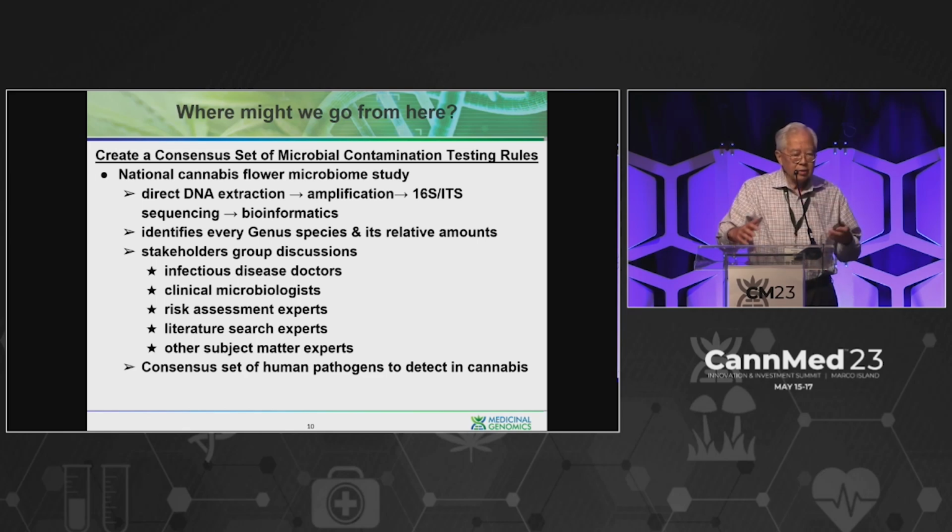So one has all this DNA now that you've amplified, and then you do sequencing of this DNA. There's now nanopore technology developed by the Oxford Technology Company, where the sequencer is a little bit bigger than a flash drive, and the computer is quite little, and you can buy one and play with it for $6,000.